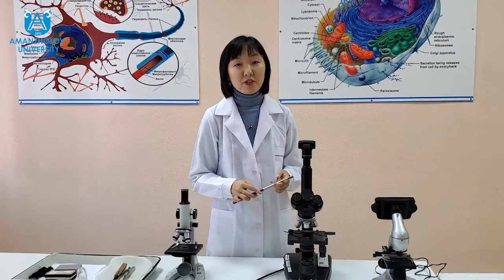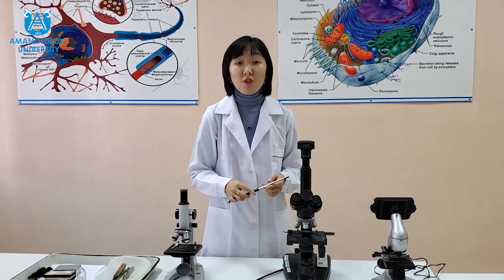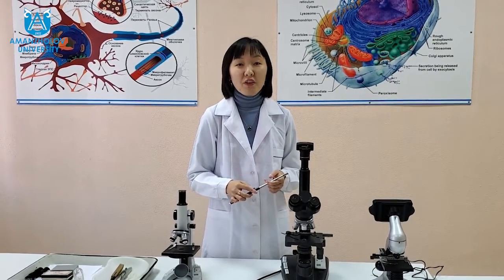Electrical part of the microscope. In modern microscopes, instead of a mirror, various light sources provided by an electrical network are used. There can be incandescent lamps, as well as halogen and xenon lamps. Also, light emitting diode, LED, illuminators are gaining popularity. Various power supplies are used to power the light sources. It can also be rechargeable batteries, which make it possible to use the microscope in the field without a connection point.